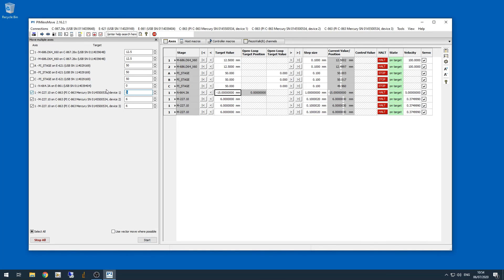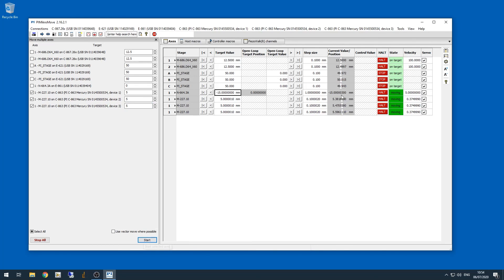Well if you've made it this far, all your PI stages are connected and working, and it's time to move on to the next part of this setup, which is changing the driver for the PI chassis, holding the lower objective x, y, and sample z stages, so LabVIEW can send serial commands to this unit.